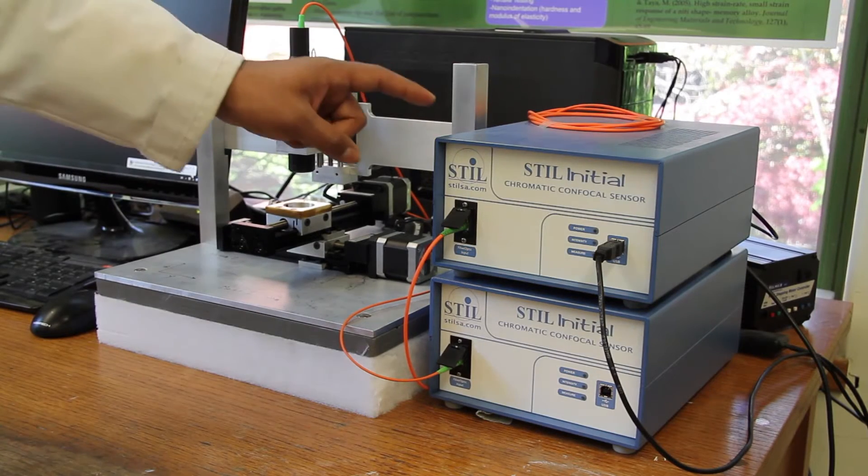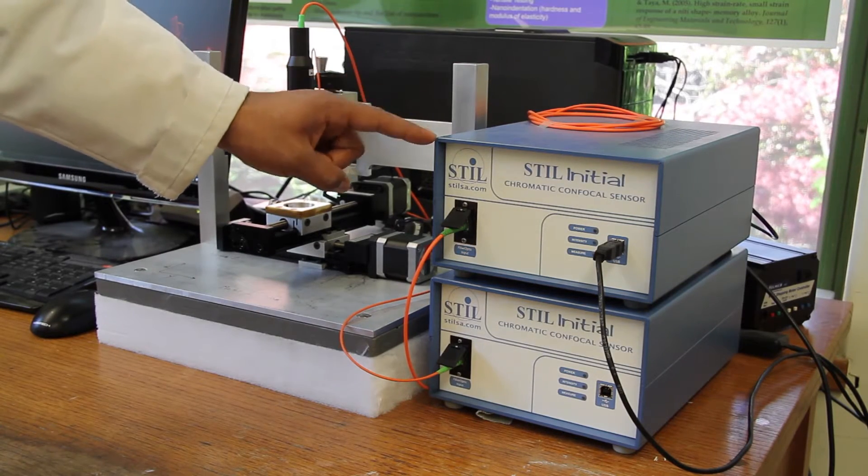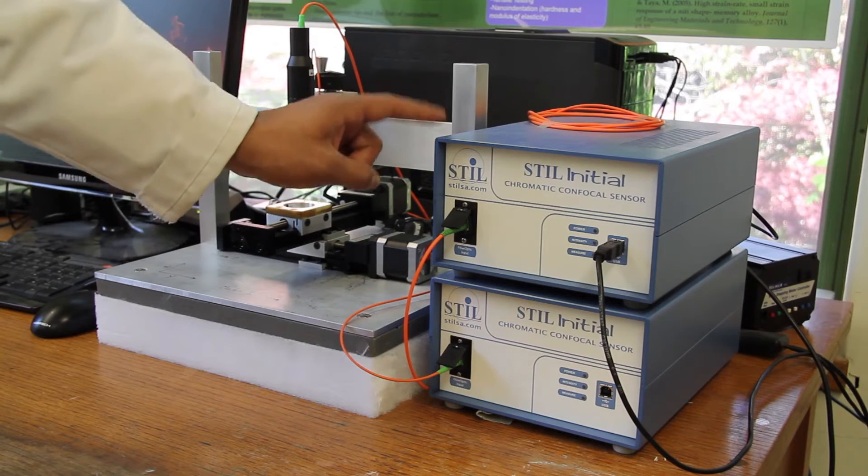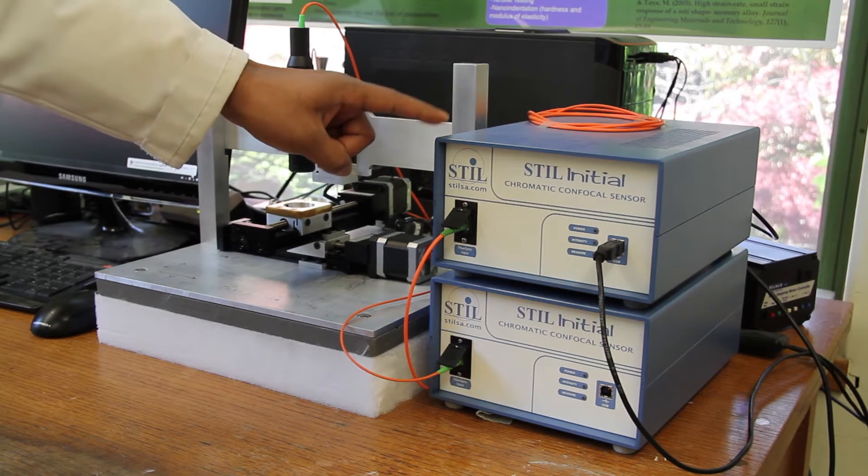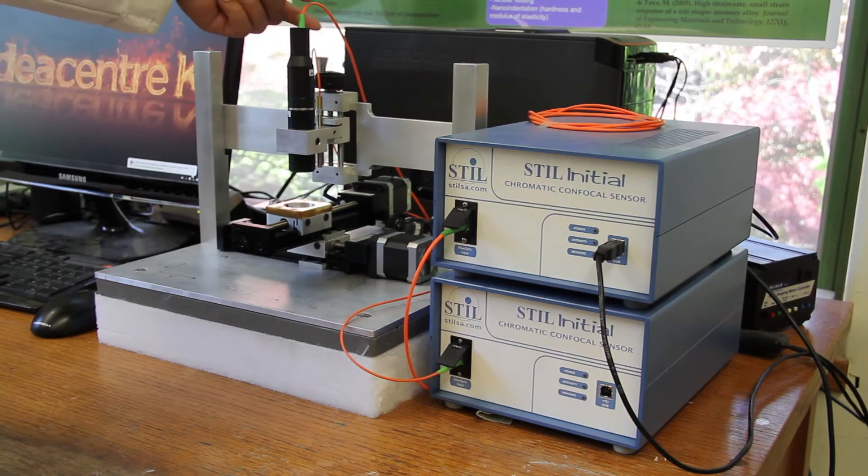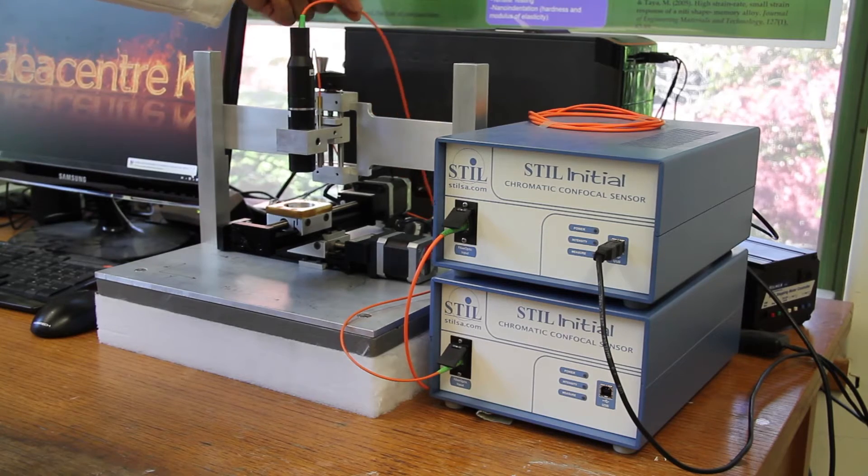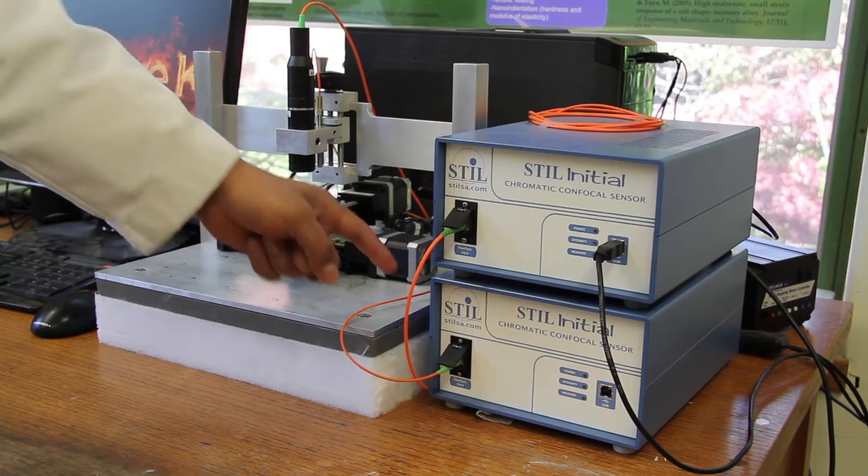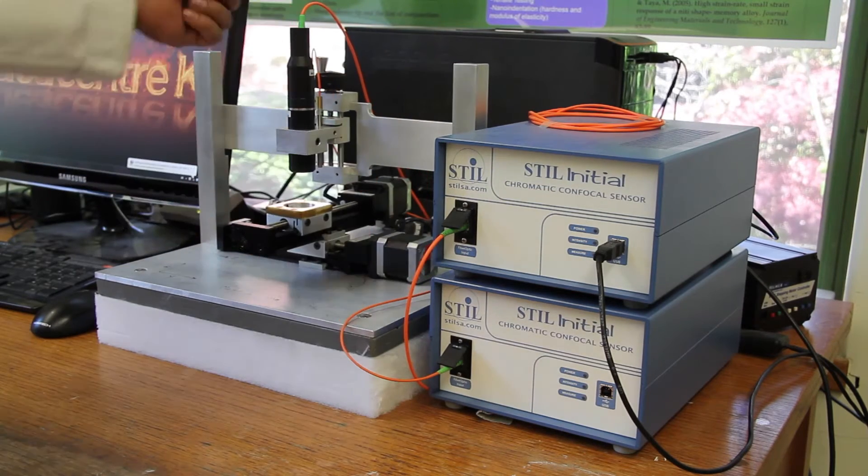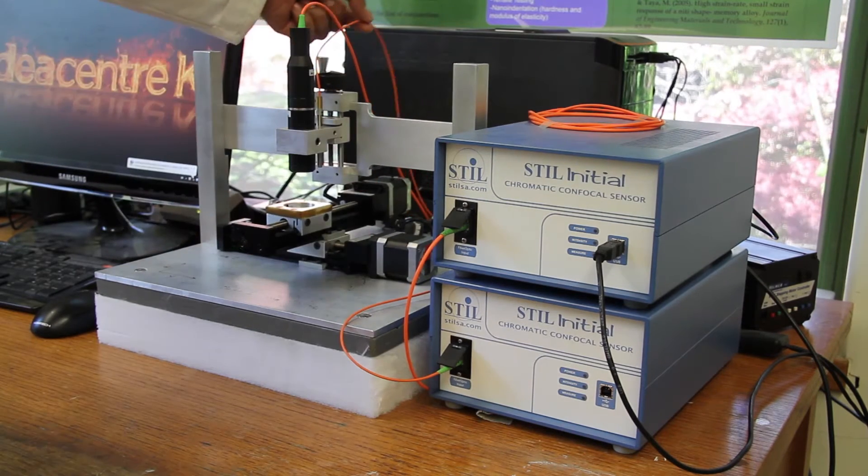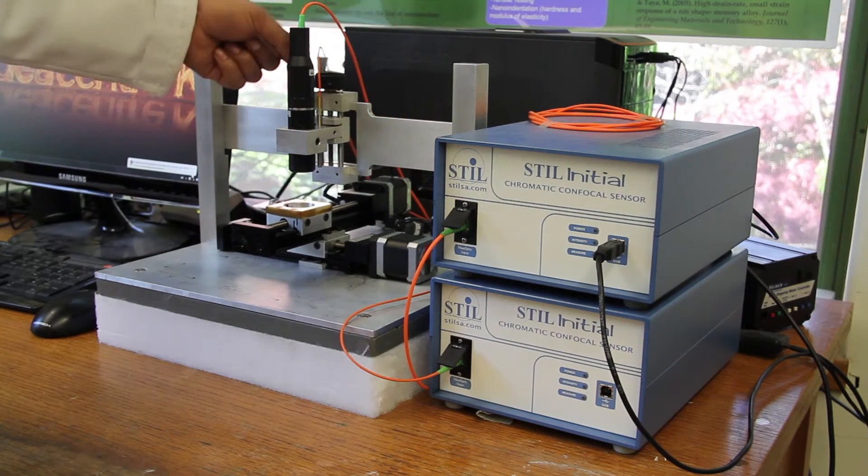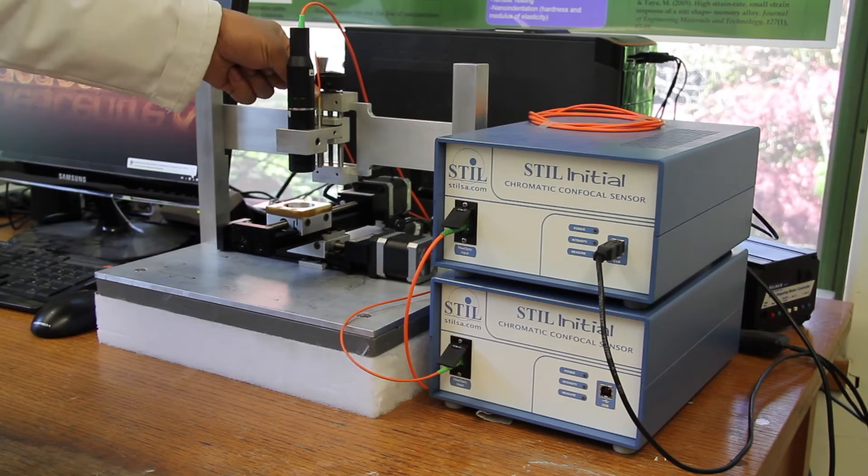We have two still initial sensors. The one on the top is used for the black pin and the one at the bottom is used for the pin at the back.